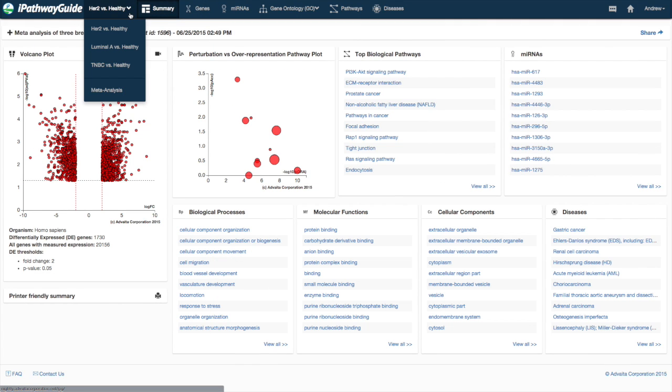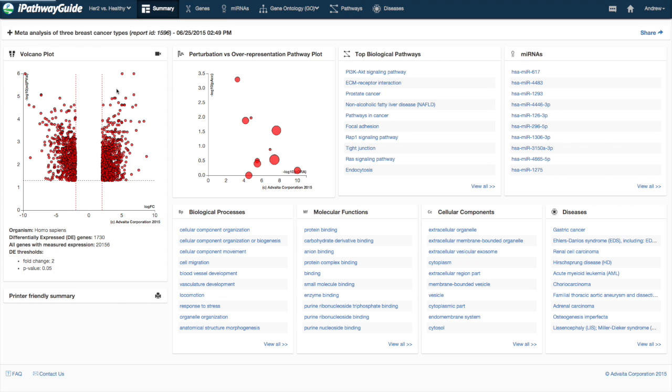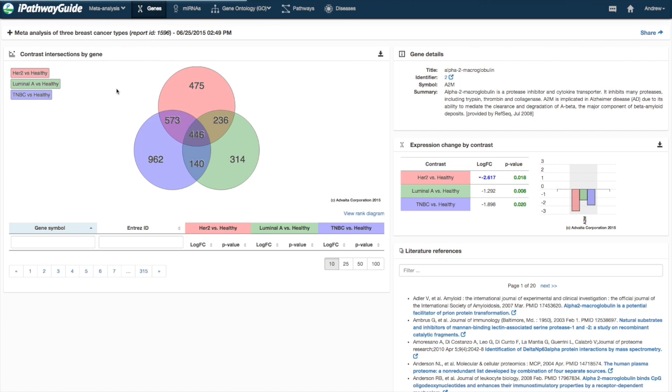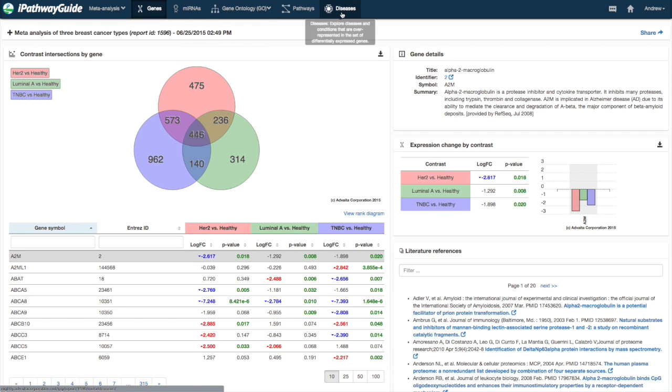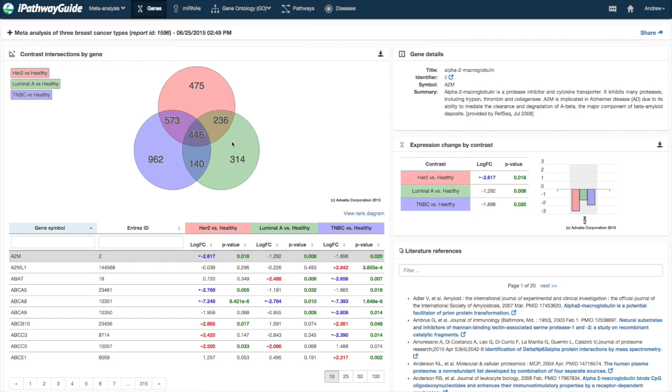From the list of available contrasts, select Meta-Analysis. The meta-analysis will provide information on significant genes, predicted microRNAs, GO terms, pathways, and diseases that may be in common or unique to each of the contrasts in the report.